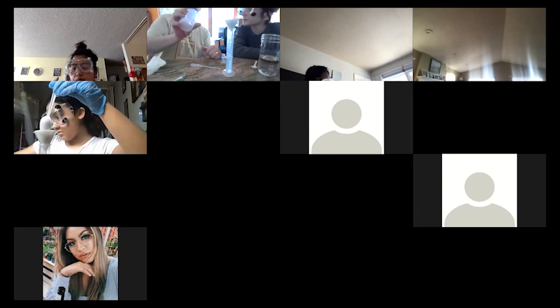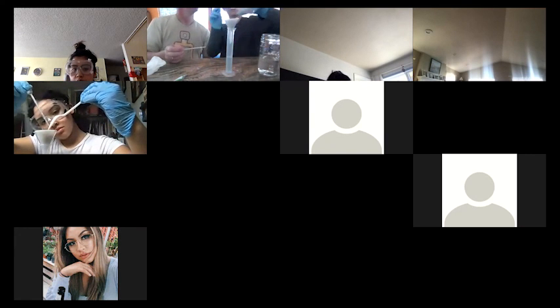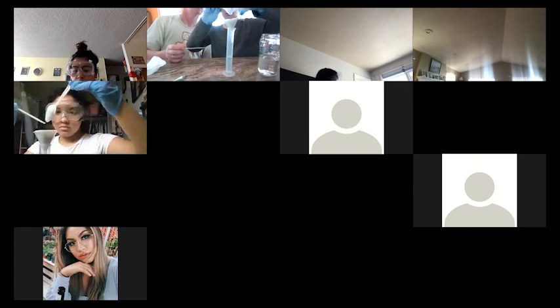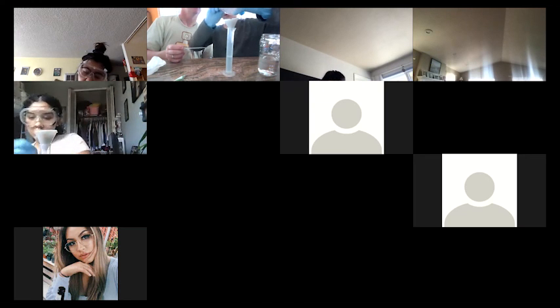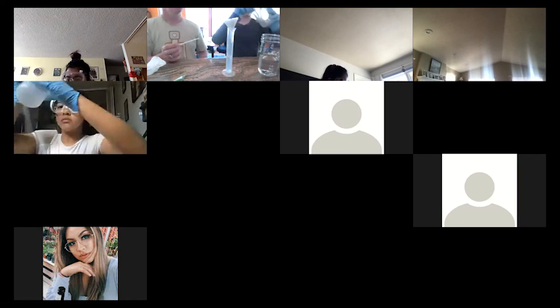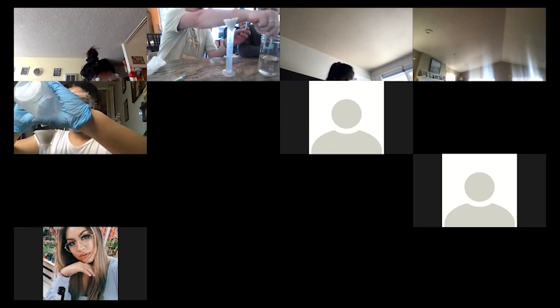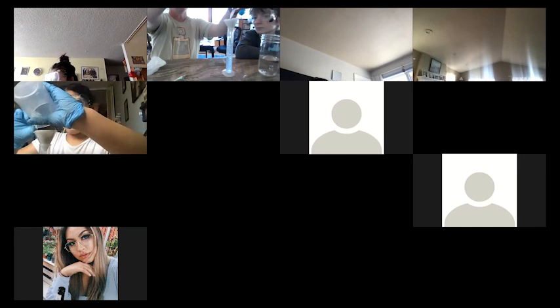Okay. Yeah, do you want to get that? Do you think we should bother with that? I think we can just get some off the top. Oh, there you go. That was a good amount. Excellent. And then there's quite a lot on this thing. Okay, so to get that off the spoon, we can just hold the spoon right over and just spray it right into the filter.